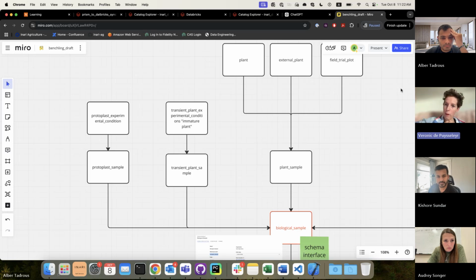But what happens is it's on selection, which means that the number of cells that are untransformed will decrease. So it's important for the AMP-seq result, it tells you how many reads have edited or unedited. So you need to know at which moment in time it is being sampled, because you expect categorical results, like bins, when you have a plant, but earlier in the process it's like a smear. So you need to know. Yes. Interesting. I didn't know that. That's cool.